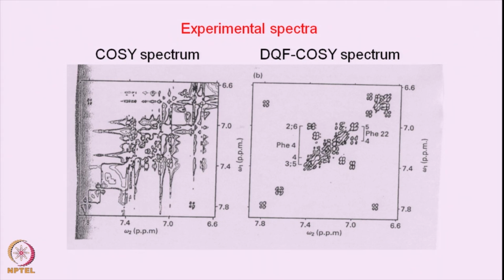So that also will be used, and this is a good illustration of the strategy of selecting the coherence transfer pathways in your spectrum.